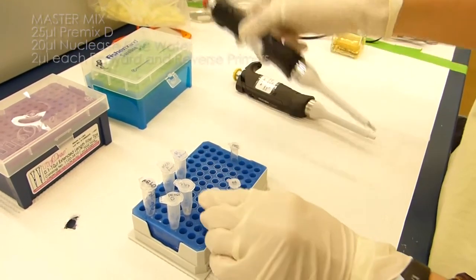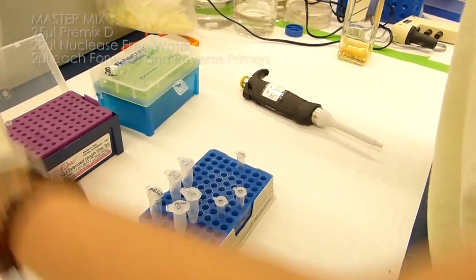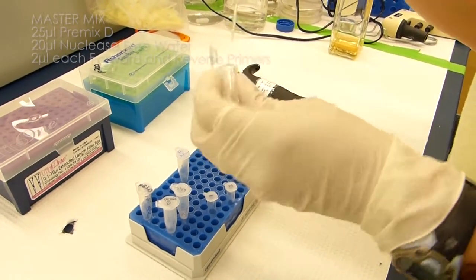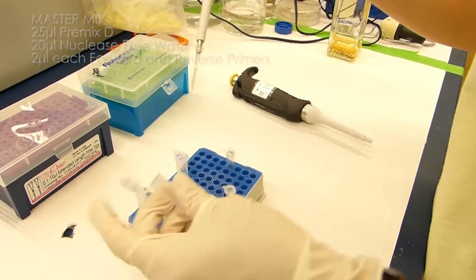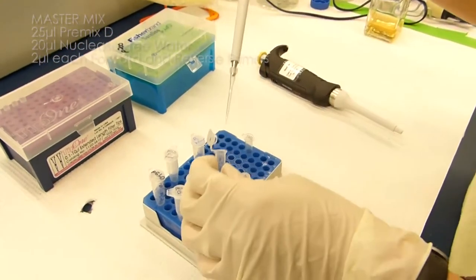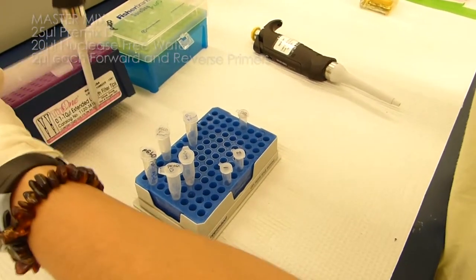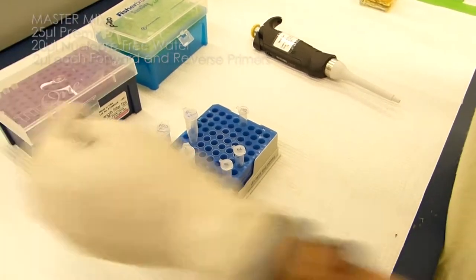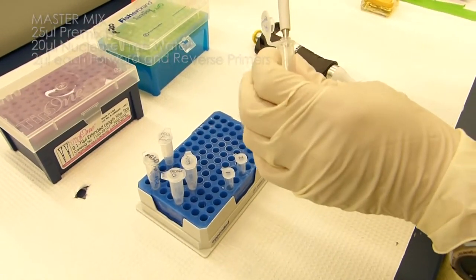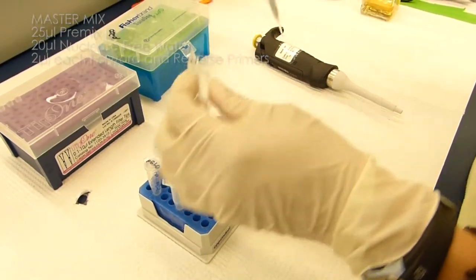Then for our primers, we'll add 2 microliters each of the forward and reverse primers. When pipetting very small amounts, I typically put the pipette tip into the liquid at the bottom just to ensure that it gets mixed.